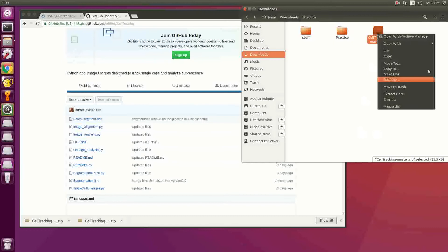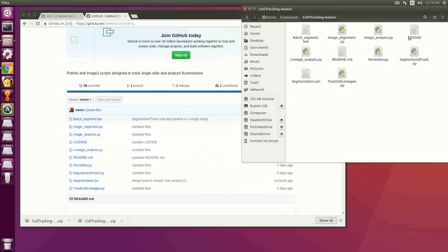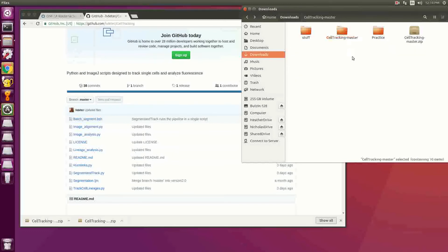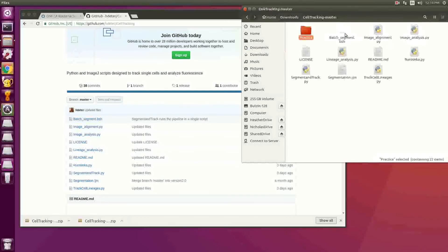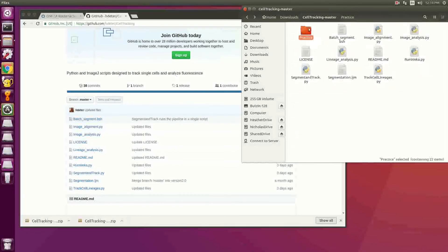Once you have the zip file, you can just extract it, and now you have all the scripts that you will need. We'll actually just be running this one, which then calls everything else. Your images that you're practicing with need to be in the same folder as the scripts — all of this should be in one folder: the folder with all your images and all of the scripts.